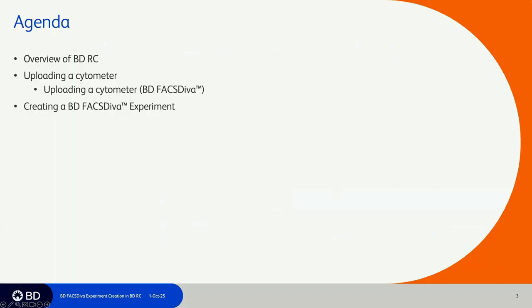For today's webinar, we're going to start with a quick overview of BD Research Cloud. Then we'll move into how to upload a cytometer specifically for BD FACSDiva experiment creation. And then lastly, we'll jump into creating that experiment in BD Research Cloud.